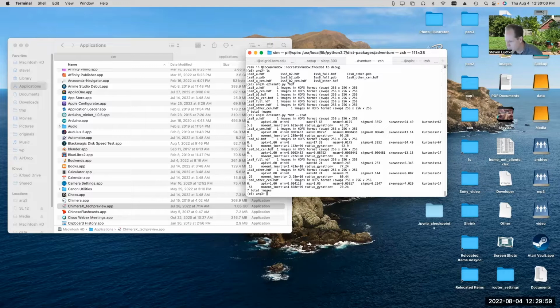I'm wondering if there's something wrong with the :8, the compression that I told it to do. I wonder if I updated my code recently. The :8 was something that we added recently, and it's supposed to preserve the density values without modification, but something a little funny is going on there.